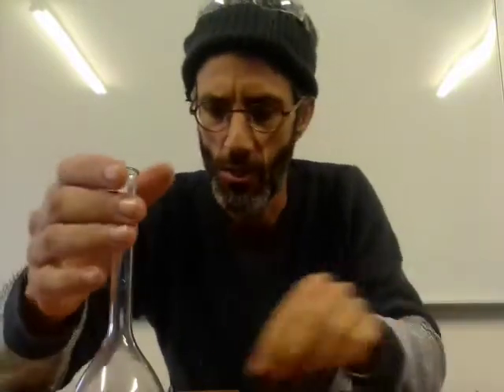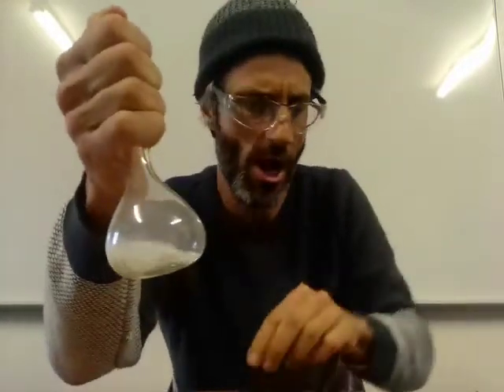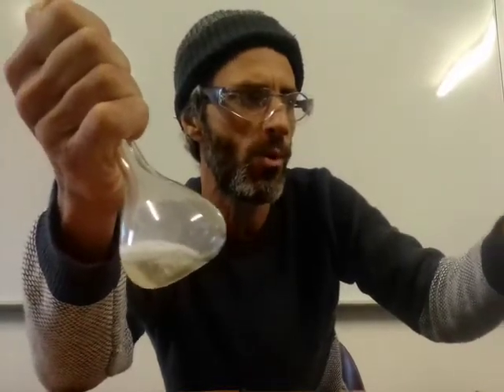Okay, so I'll just get a little bit. I'll need a little match here. Right, so here we go. Goggles on. Dropping it, and what you'll see straight away, quite a lot of bubbles. You can see this chemical reaction going on. There's some kind of gas released, and we're going to try and figure out what gas it is.